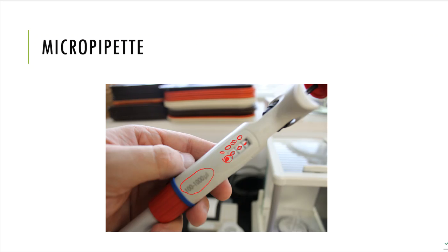If I needed 100 microliters, or 0.1 mL, then this needs to say 0100. There is my 100. All right, so just a little bit about our weird little micropipettors that we have in the lab. That's how they're made. Some of the more professional micropipettors that could cost $1,000 or more do not have this weird ambiguity in place, and they really do have a true proper readout. But these, they're pretty cheap. They're made for student use, actually, and they just thought they could get by with it without a problem.